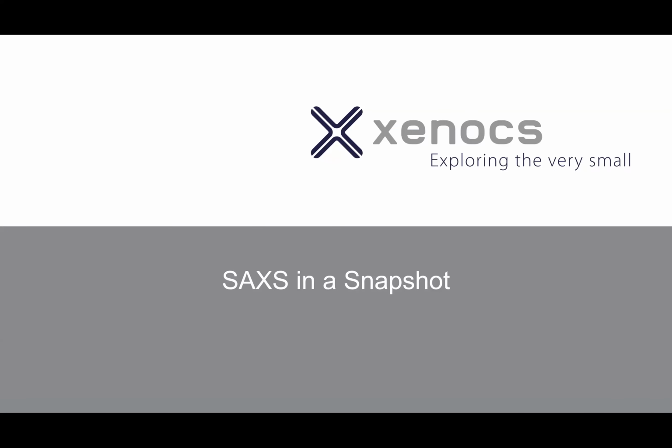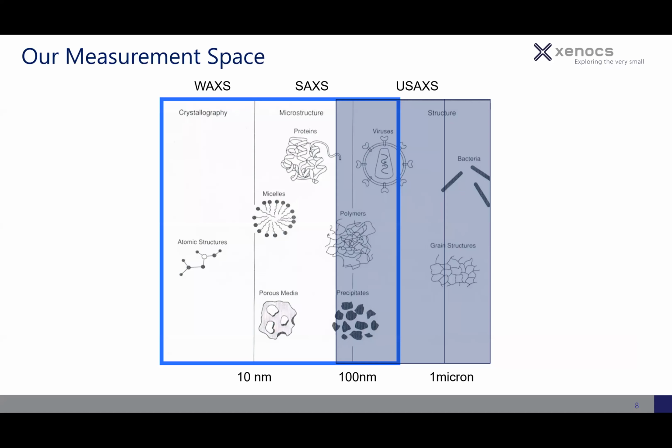Let me give you an idea of small angle scattering in a quick snapshot. This is our measurement space, and the idea is that we can see, and I'll use that term loosely, or probe structures with size dimensions that go all the way from atomic structure, which we measure in wide angle X-ray scattering, to features that are a micron in size. This is a tremendous four orders of magnitude or more of spatial dimensions that we can probe with a single X-ray platform. Most of the time when we talk about SAXS, we're really working in this 10 to 100 nanometer range.